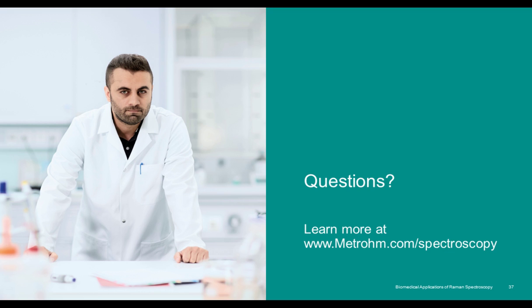Sure. So, yeah, for very complex samples like soil, again, it's going to depend on what you're looking to measure here. A lot of times in samples like soil analysis, we're looking for more elemental information than molecular information quite often. And so Raman may or may not be the best tool for that. I would say that probably an elemental technique like LIBS, laser-induced breakdown spectroscopy, is better for that.